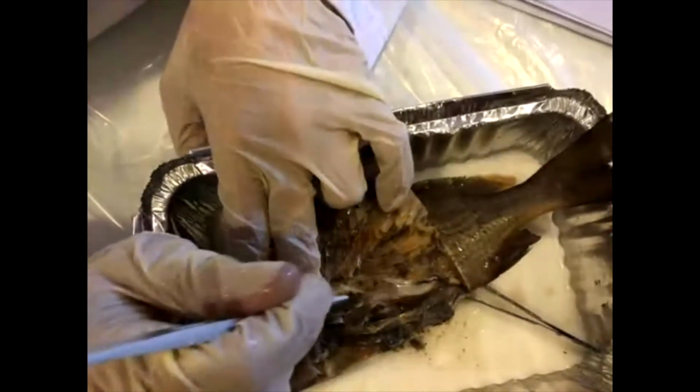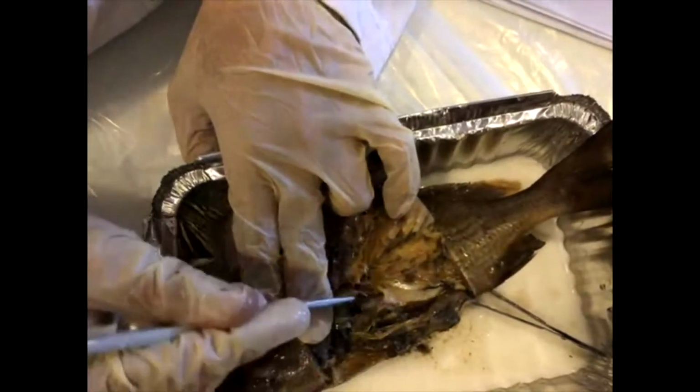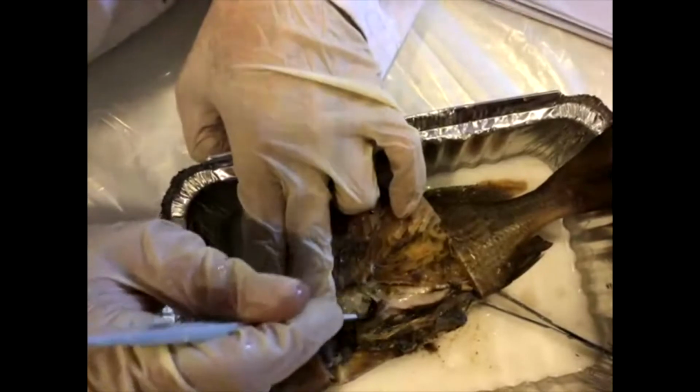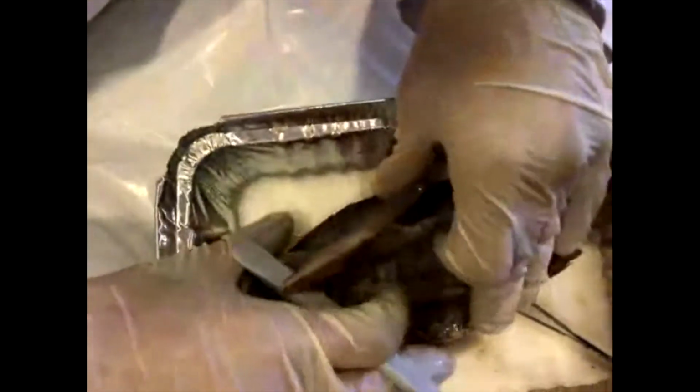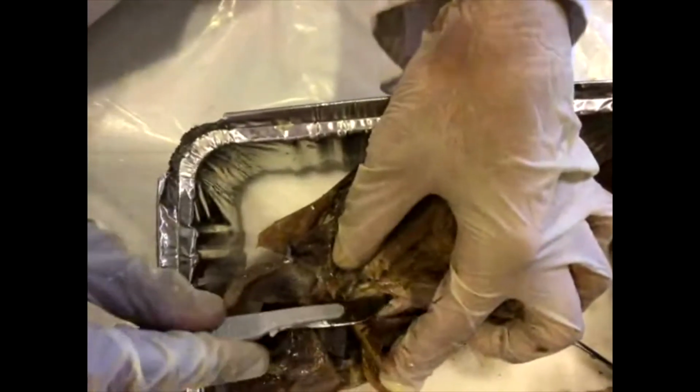And this would be a good thing to draw onto your diagram if you wanted to draw along with that. It's quite hard, but you can see that there's really nothing in it. It's actually kind of an air-filled sac. And so this is a unique organ that even sharks don't have.